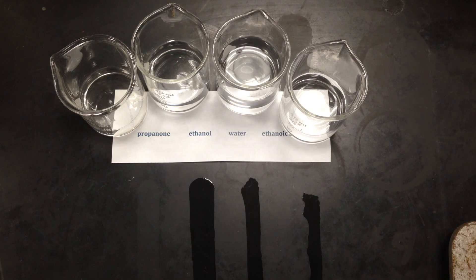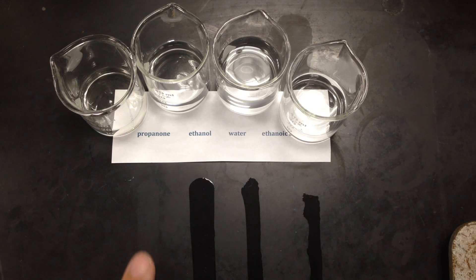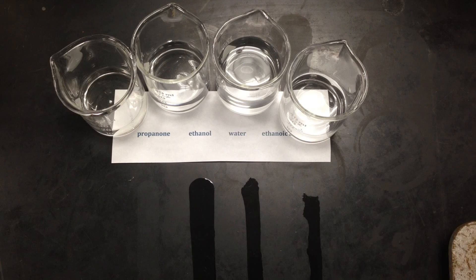So it looks like the first one clearly evaporates the fastest, which means its molecules are escaping into the gas phase faster, and propanone has the highest vapor pressure. So it looks like the fourth one might be evaporating faster, but the problem here is that it may appear that way only because they're actually beading up.